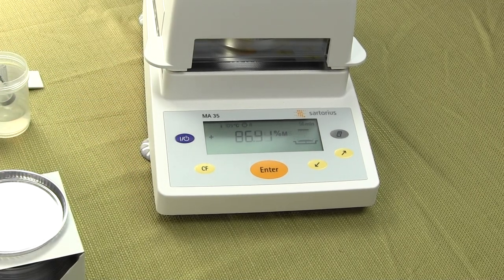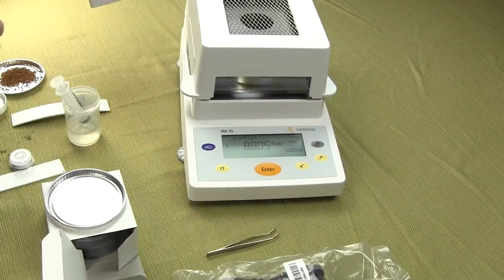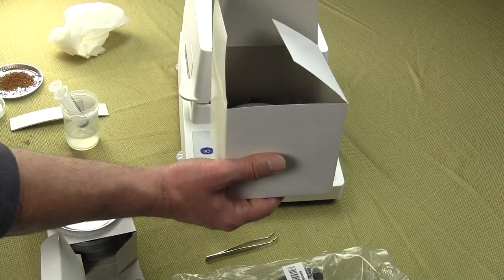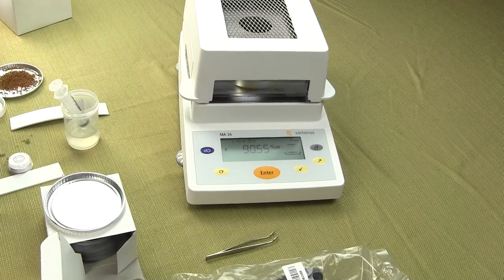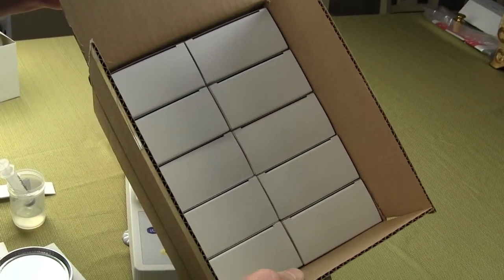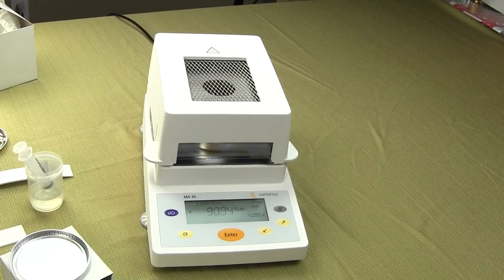The balance comes standard with a power cord and a pair of tweezers so you can lift the pan. From the manufacturer, Sartorius includes approximately 50 disposable moisture pans. We also sell moisture pans at a great discount — they come 500 to a master carton, which is 10 boxes of 50, and we sell this for about $160, which is much less than buying directly from Sartorius.